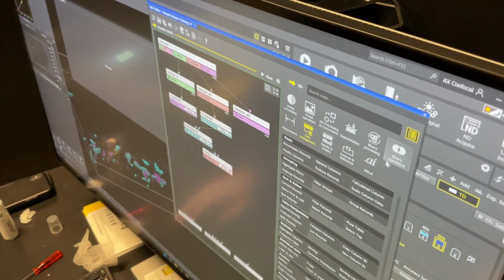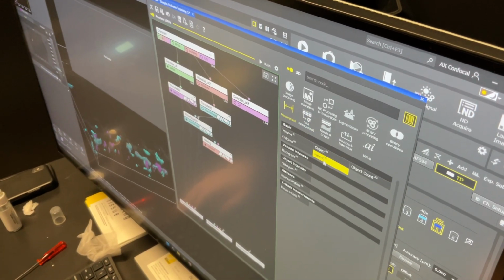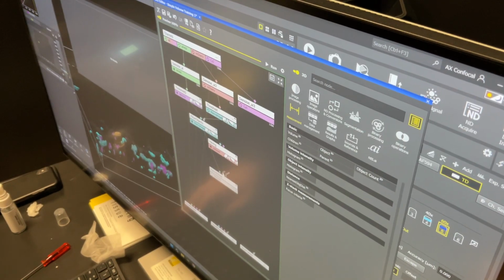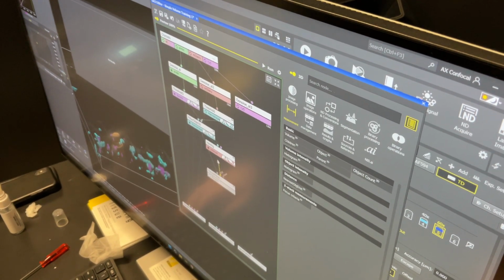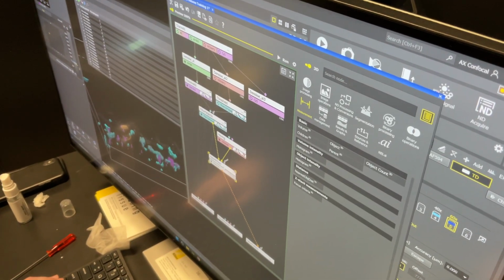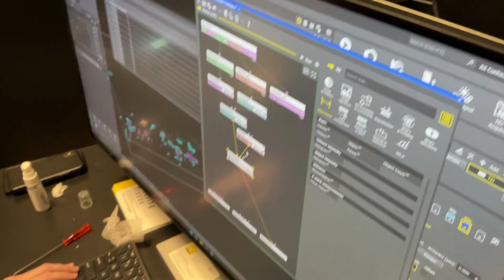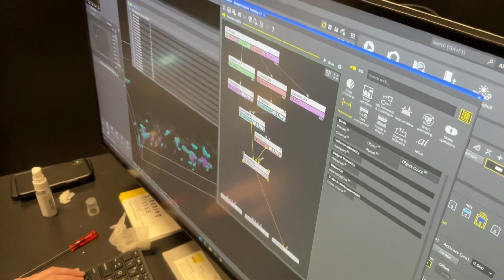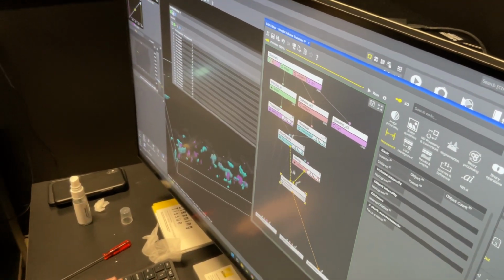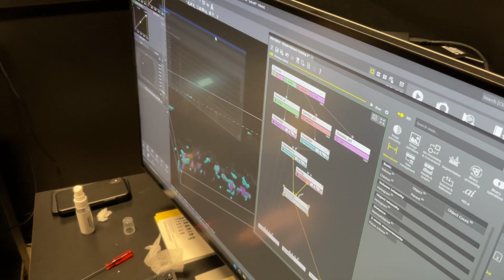Let's do this. I think a parent-child. Maybe it's relevant. Josh, you wouldn't care about the uninfected though. I do. I'm only going to be looking at infected cells, and then I just care about the intensity, I guess. The only downside to parent-child is it doesn't give us the ability to link to more than one channel for intensity, which is kind of frustrating. So we might end up at a joining step.